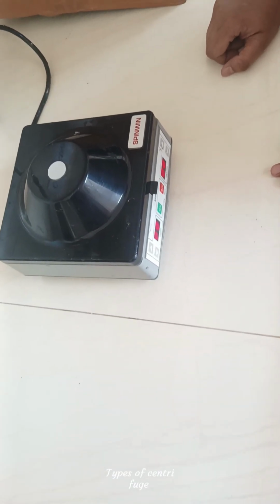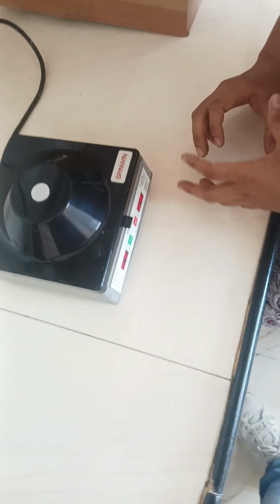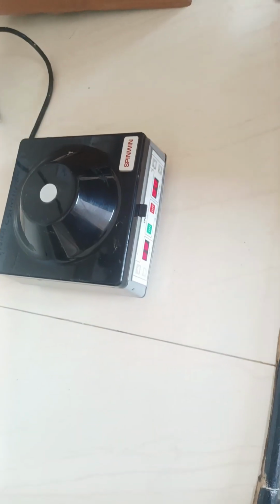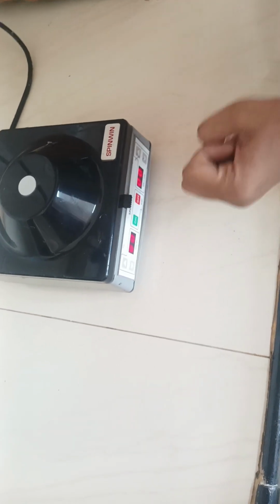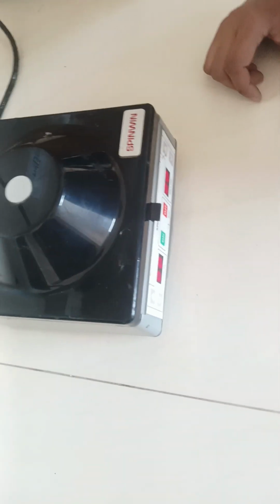Now basically you all know what a centrifuge is. The separation occurs on the basis of size. A centrifuge is a machine which is basically used for the separation of molecules based on their density or their weight. So if you want to separate something on the basis of density, you can utilize it.